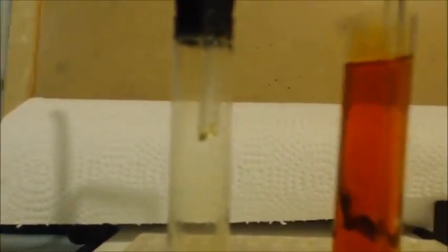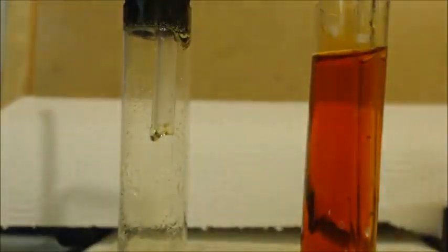See that ring on top? If you need to see it bubbling through or not, I'll just let that finish up. You can see my point. This is the last thing.